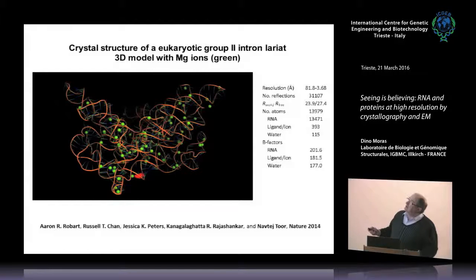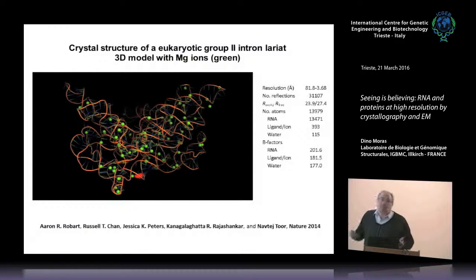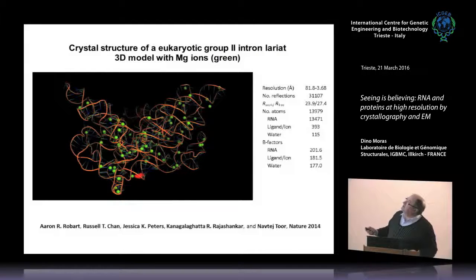That's okay. But here you have lots of magnesium ions. If you read the paper, it's another Nature paper. It's not because it's in Nature that everything is fine. This is another of my take-home messages. Nature 2014 is not very far. I could show you maps of RNA structures at high resolution where you see the magnesium, the tRNA. It looks very nice. But here I had a problem: the resolution is rather poor, so how could they fit that? This is technical, rather poor, but okay.